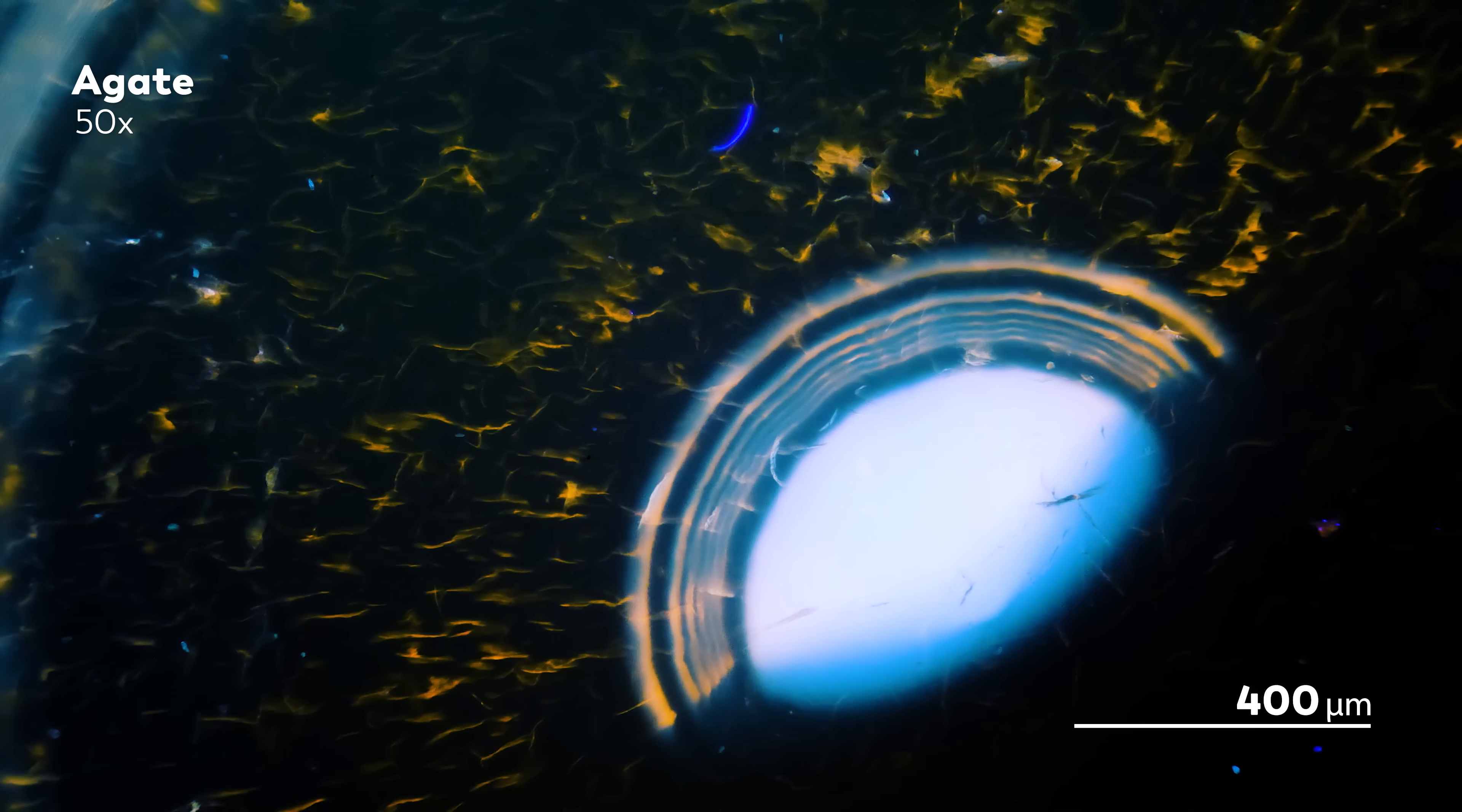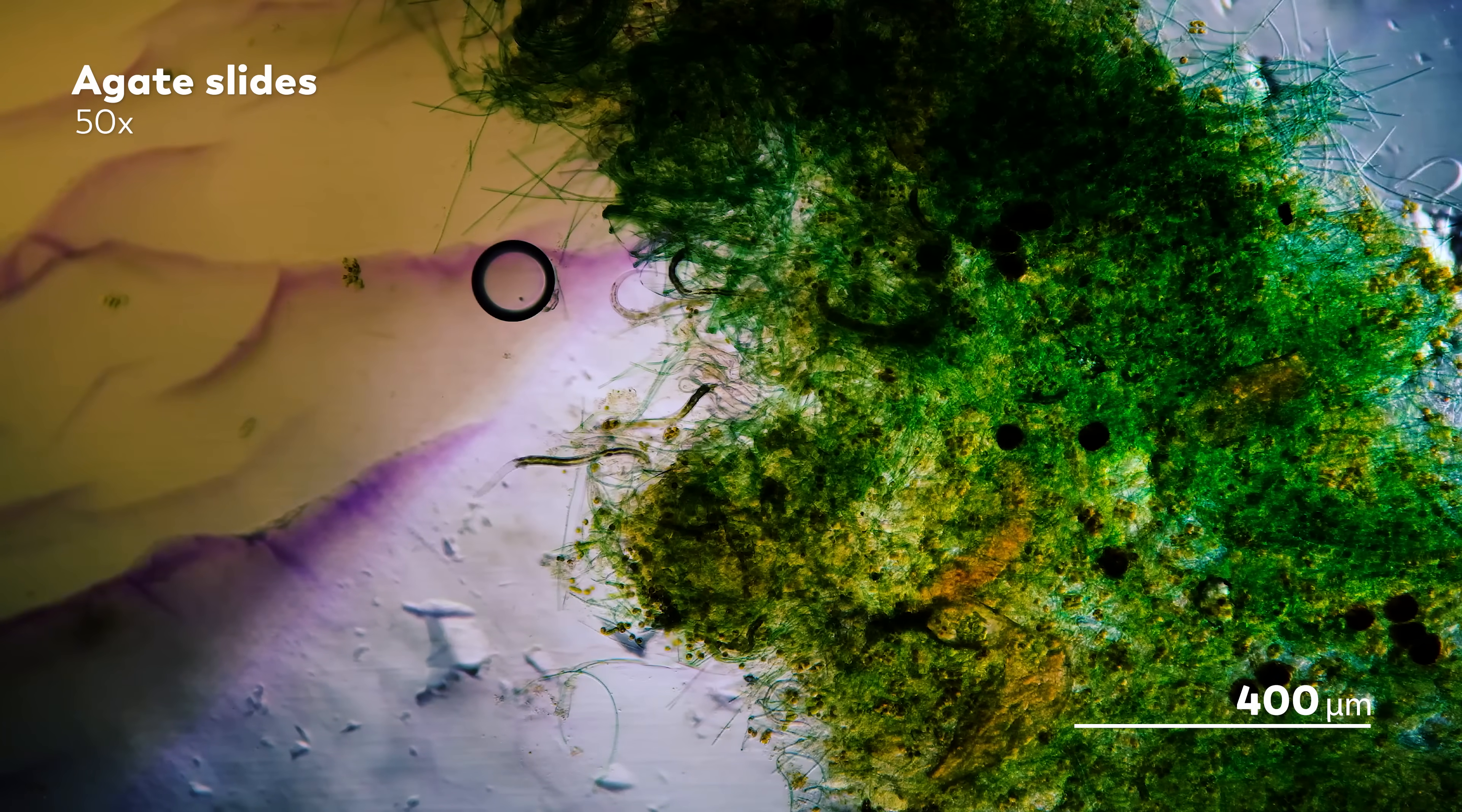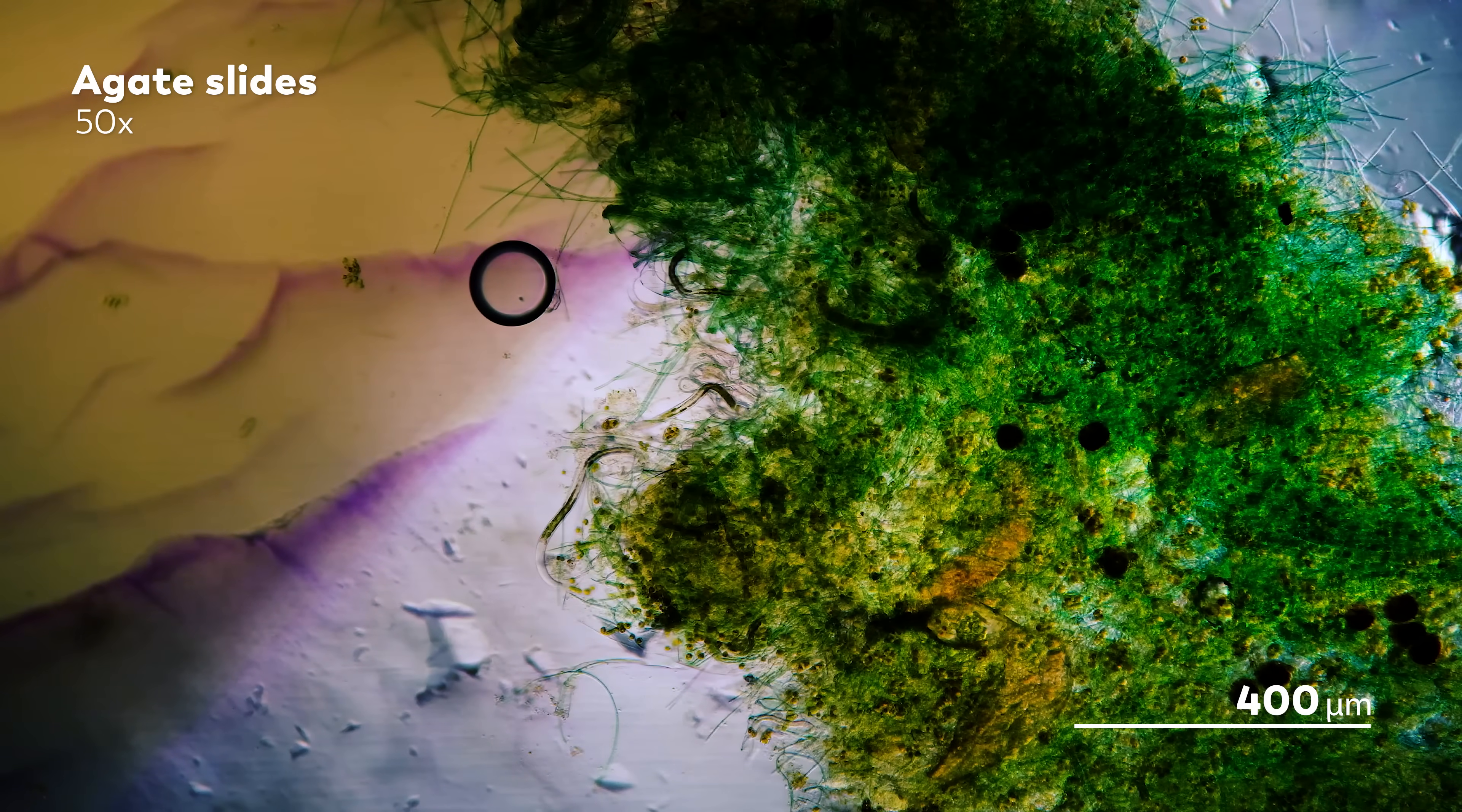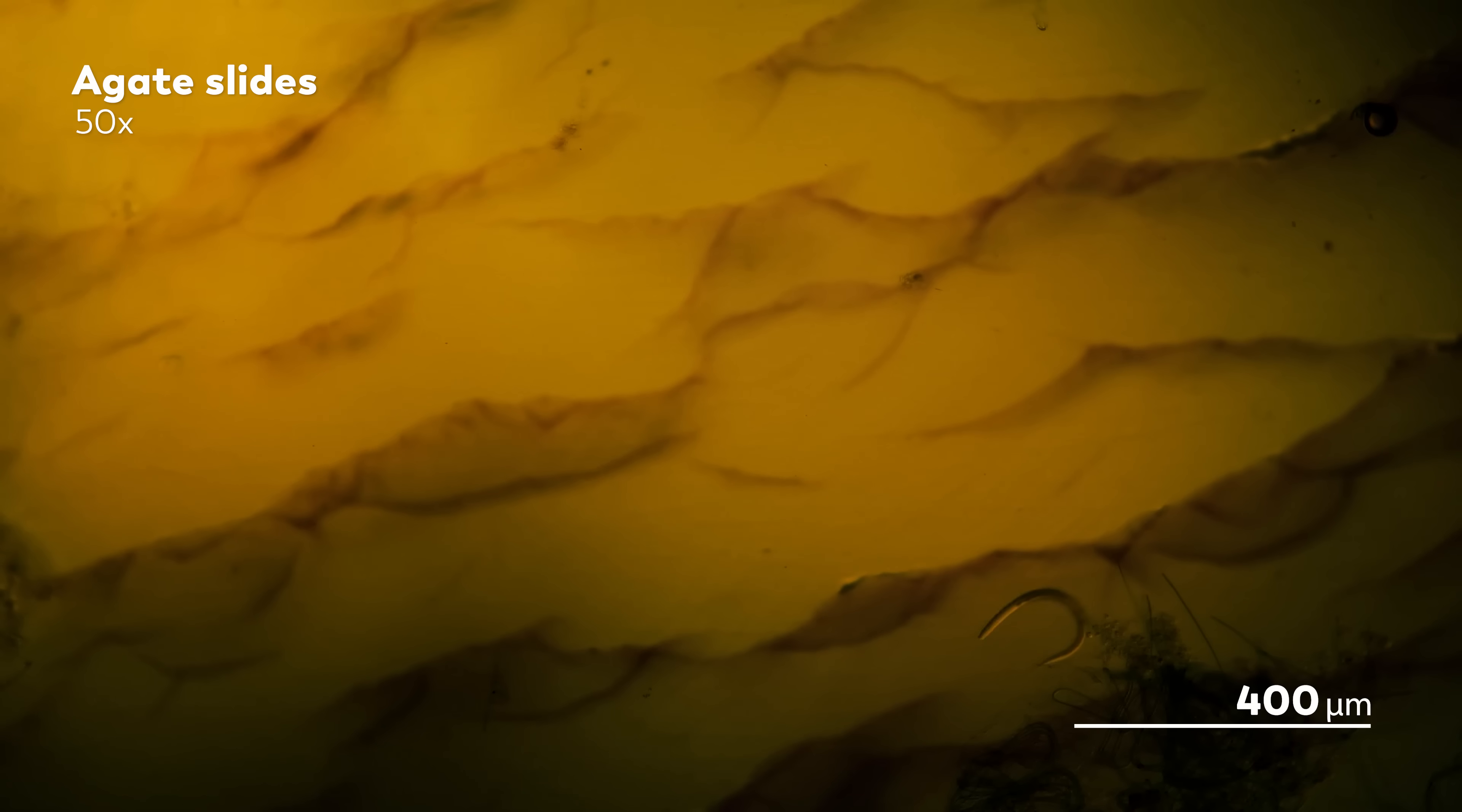But going back to the idea of these geodes as a landscape, James was inspired to see if he could actually use these slices as a slide. So, he added a drop of pond water to the geode and placed a coverslip on top. And we think the final product is super cool. Like, if the microcosmos were set against a desert. There's an almost science fiction quality to watching the nematode here frantically wiggle against this backdrop.